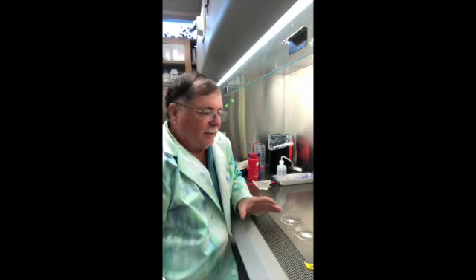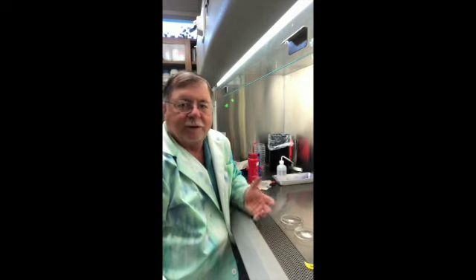Hi class, today we're going to look at starch hydrolysis. In our agar media we put starch as the carbohydrate. If a bacteria has the ability to break down starch with an enzyme that it secretes called amylase, then the starch will be changed into glucose, because starch is just a series of thousands of glucose molecules linked together. The amylase will release those bonds and have free glucose.